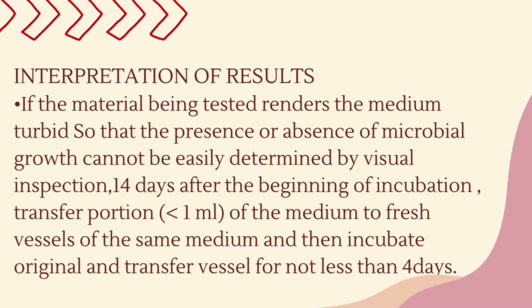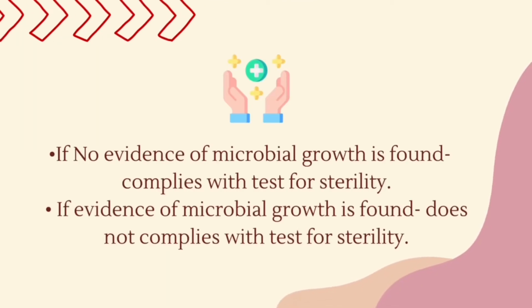Interpretation of result. If the material being tested renders the medium turbid so that the presence or absence of microbial growth cannot be easily determined by visual inspection, 14 days after the beginning of incubation, transfer a portion of less than 1 ml of medium to fresh vessels of the same medium, and incubate the original and transfer vessels for not less than 4 days. If no evidence of microbial growth is found, it complies with the test for sterility. If evidence of microbial growth is found, it does not comply with the test for sterility.